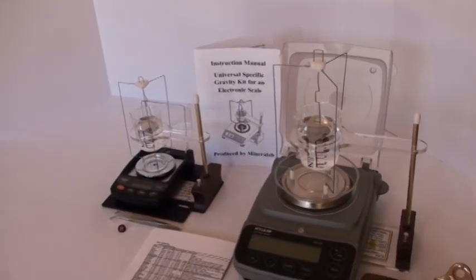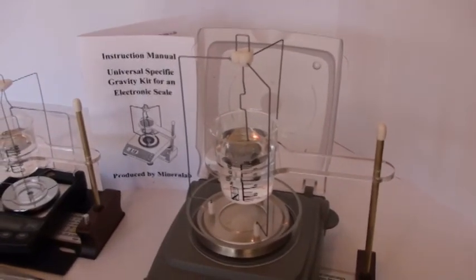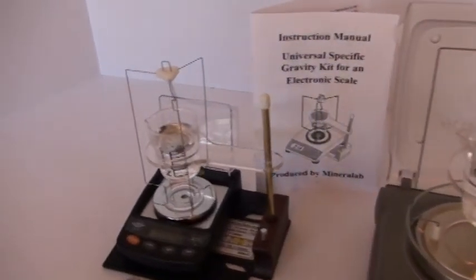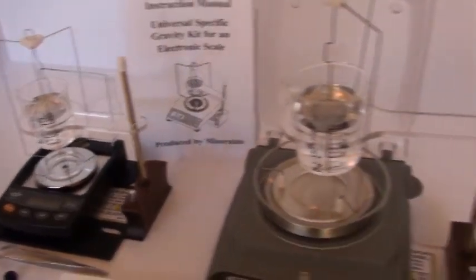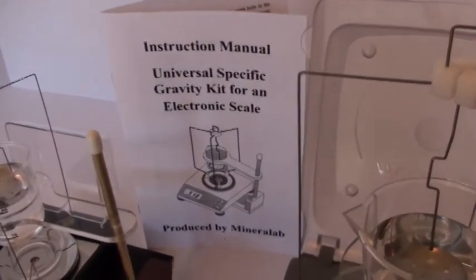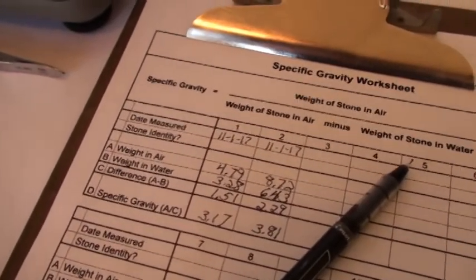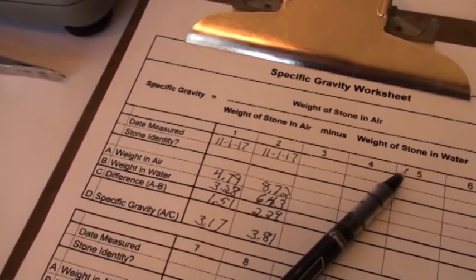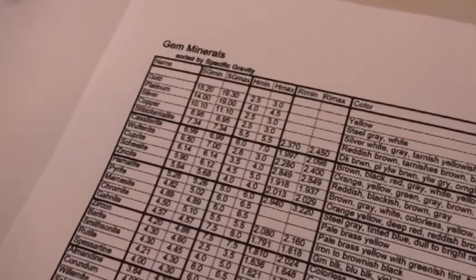You can see that our kit is very complete. We include a weighing pan assembly that sits right on top of the weighing platform of the scale, along with a beaker holder that slides in from the side. And then we have an illustrated instruction manual, a specific gravity worksheet for recording your measurements and doing the simple calculation for SG, and a table of gems and minerals sorted by specific gravity. We throw in our tweezers.